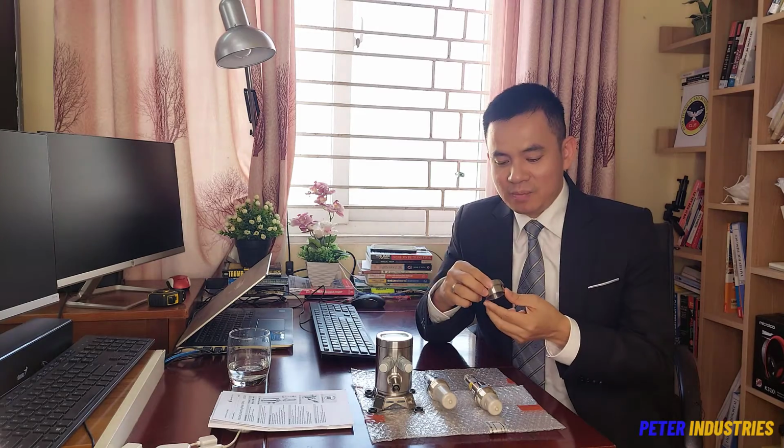Alright, and this is the process connection. Anderson Negele has an outstanding process connection, Clean-Adapt. It requires no O-rings, no gaskets or sealants, and it is maintenance free with no dead leg. And other process connections like dairy clamp, Varivent, dairy flanges are also available from Anderson Negele. Process connections for hygienic food and beverage.